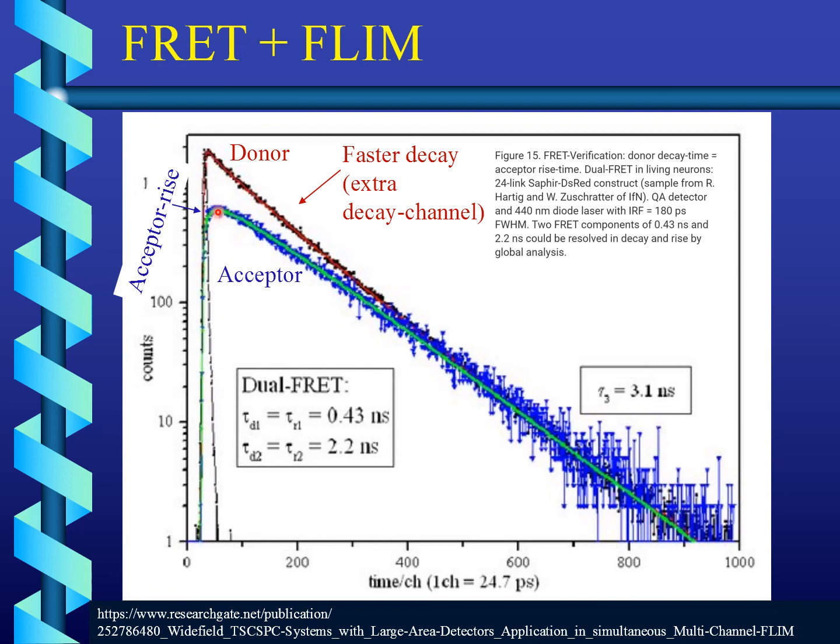And in my mind, if you want to prove you had Förster transfer, this is really the best proof, because I cannot imagine any other effect other than Förster transfer or probably Dexter transfer, so another type of energy transfer, to give rise to this effect that you see an acceptor rise before it actually decays. So any kind of molecular transition or something like this would not have this effect. They would just lead to changes in lifetimes, but not to an acceptor rise in the lifetime decay.